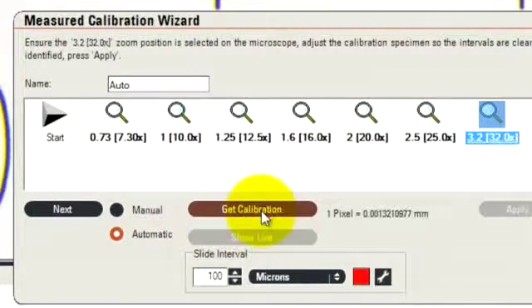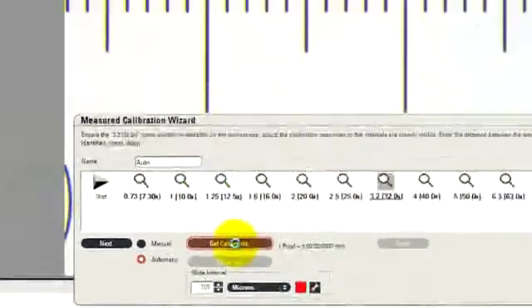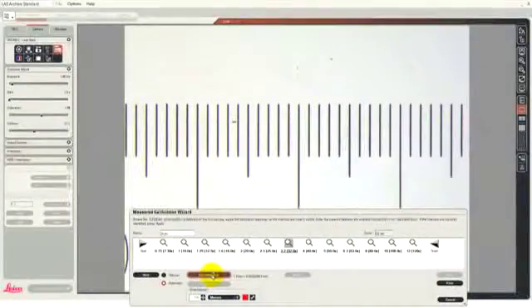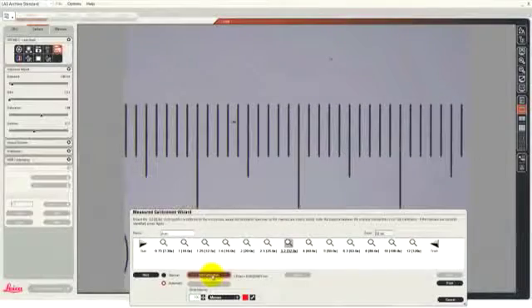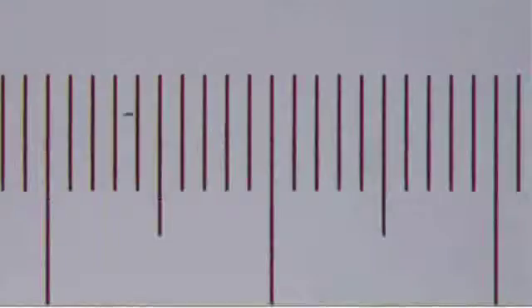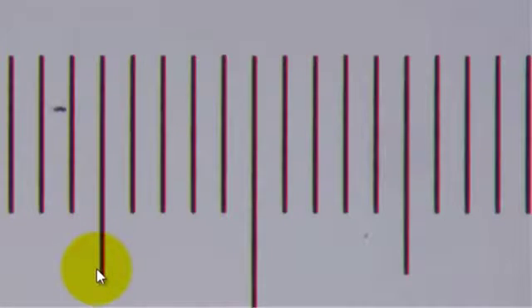So instead of having to draw lines on the image, I click on Get Calibration and the software will automatically calculate the lines and show me them on the screen. And you can see here that it's detected all the edges in the calibration slide.